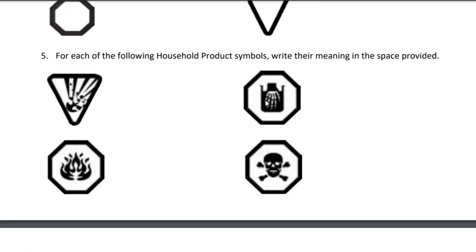So you'd have, this one's corrosive. It's some kind of acid or strong base. You learn about that in grade 10, and it'll actually burn your skin. So you want to make sure that you don't make contact with your skin. Obviously this one will be the poisonous one, flammable and explosive. Sometimes it's explosive not just on its own, but explosive like if you heated up the spray can, it would explode because it's already a gas under pressure.